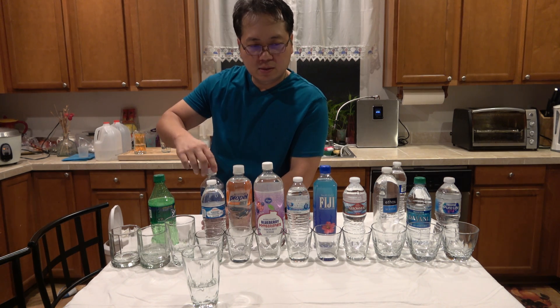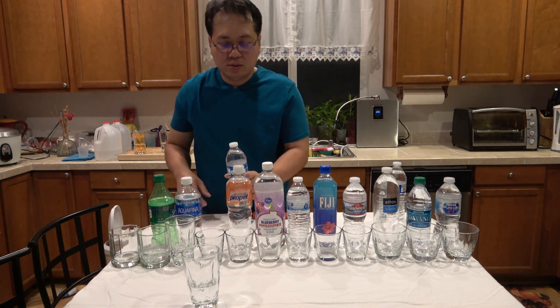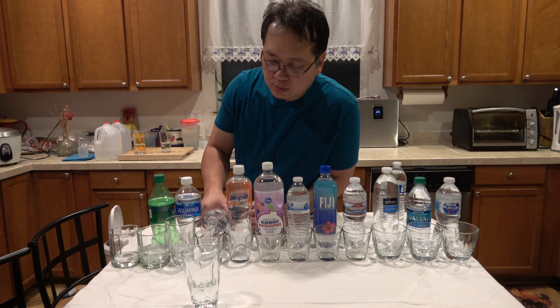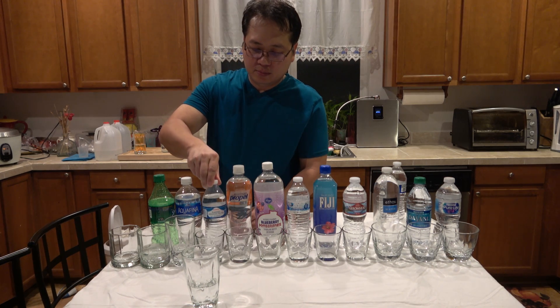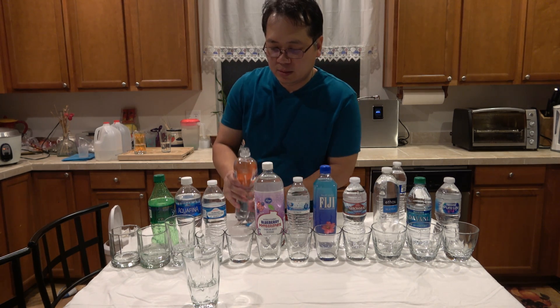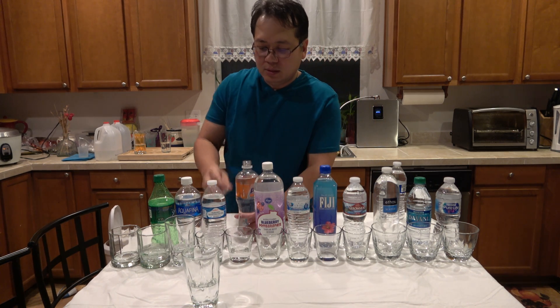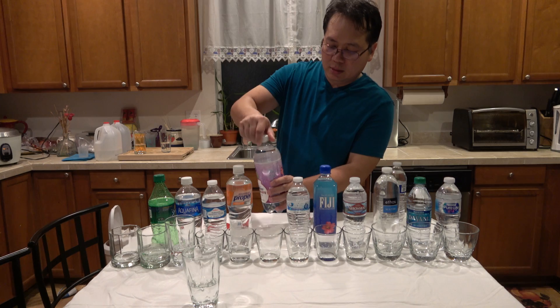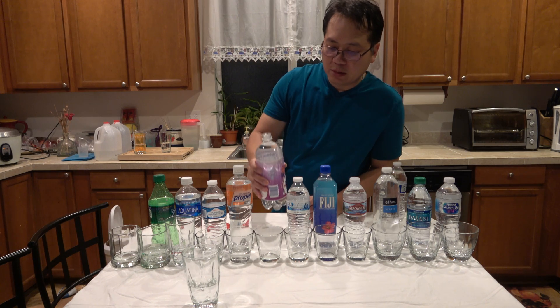What I have here is Aquafina, and this one is a Fred Meyer purified drinking water, this is a Gatorade Propel, and this one is also a Gatorade Propel.